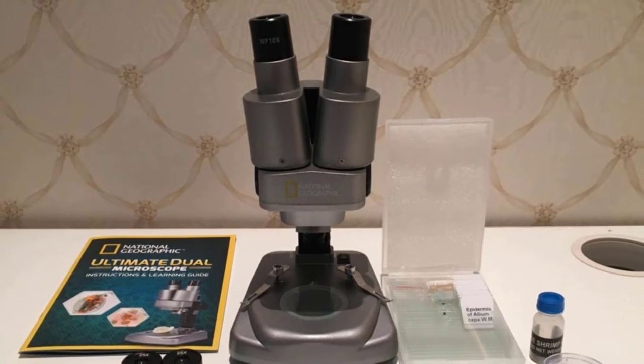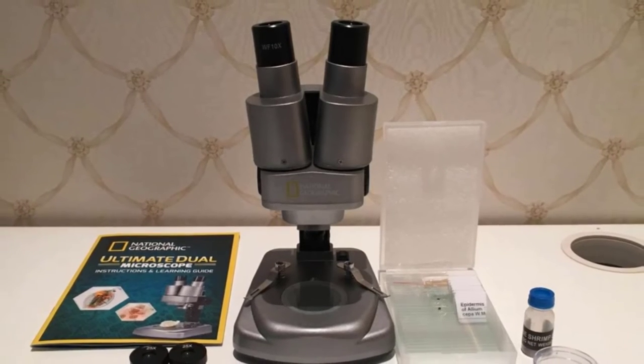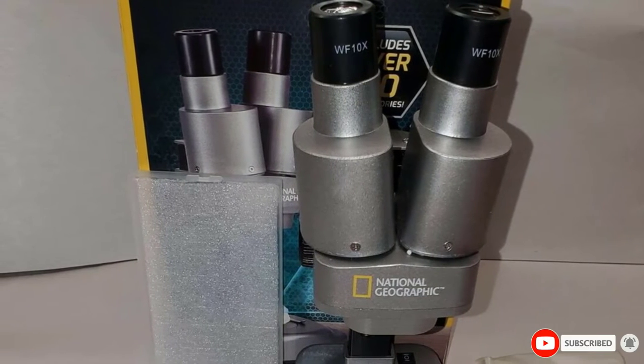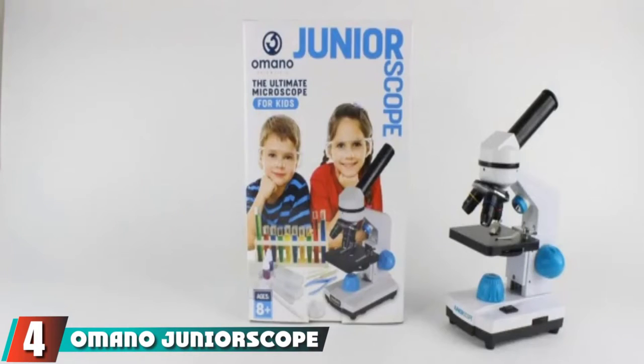The kit that comes with the microscope features some tweezers, mounted samples, blank slides, and brine shrimp experiment to kickstart your kid's microscopic journey. Next, at number four, we have Omano JuniorScope Microscope for Kids.